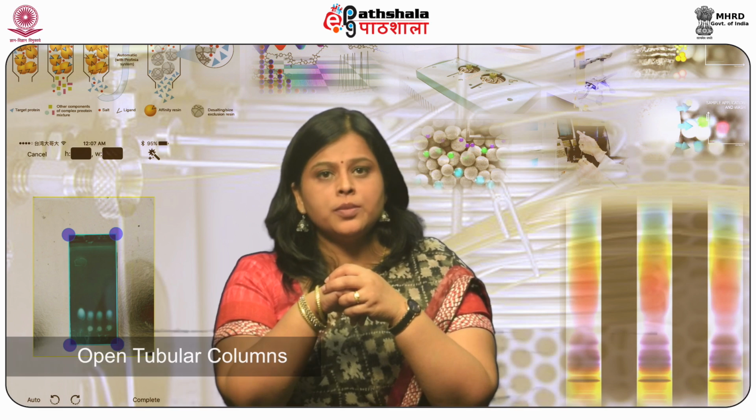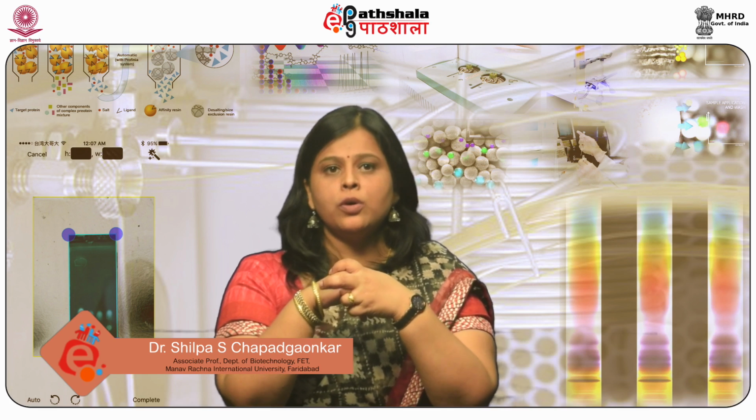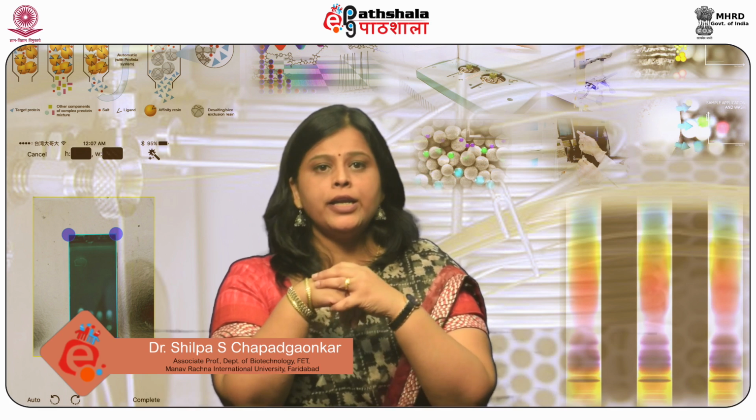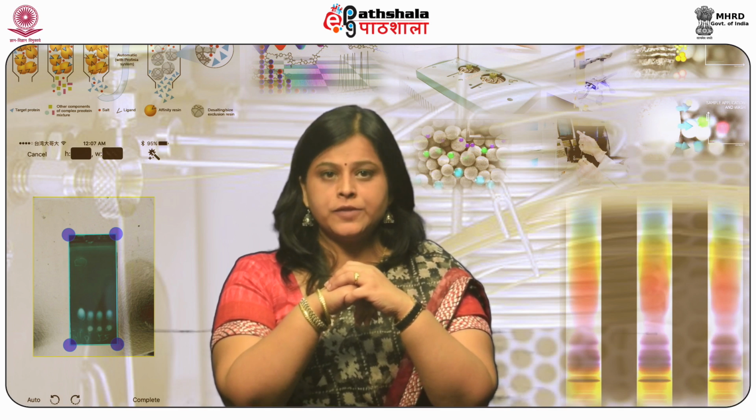Open tubular columns or packed silica-based columns can be used for supercritical fluid chromatography. Though analysis of polar compounds is difficult with pure carbon dioxide as mobile phase, modifiers and additives can be added, which affords the analysis of polar molecules also with SFC.